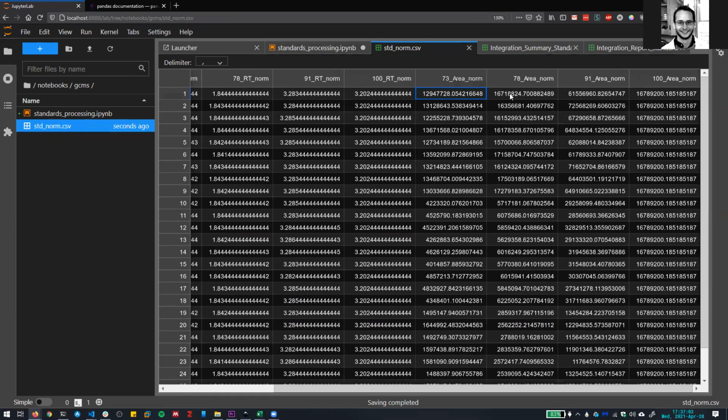It does look like these things did not get rounded to integers, which is maybe something we can think about fixing. But anyways, the data, yeah, really easy to export. To CSV is the function. So you can take the data and analyze it in Pandas, and then you can export it as CSV and then plot it using Excel if you want to do that.